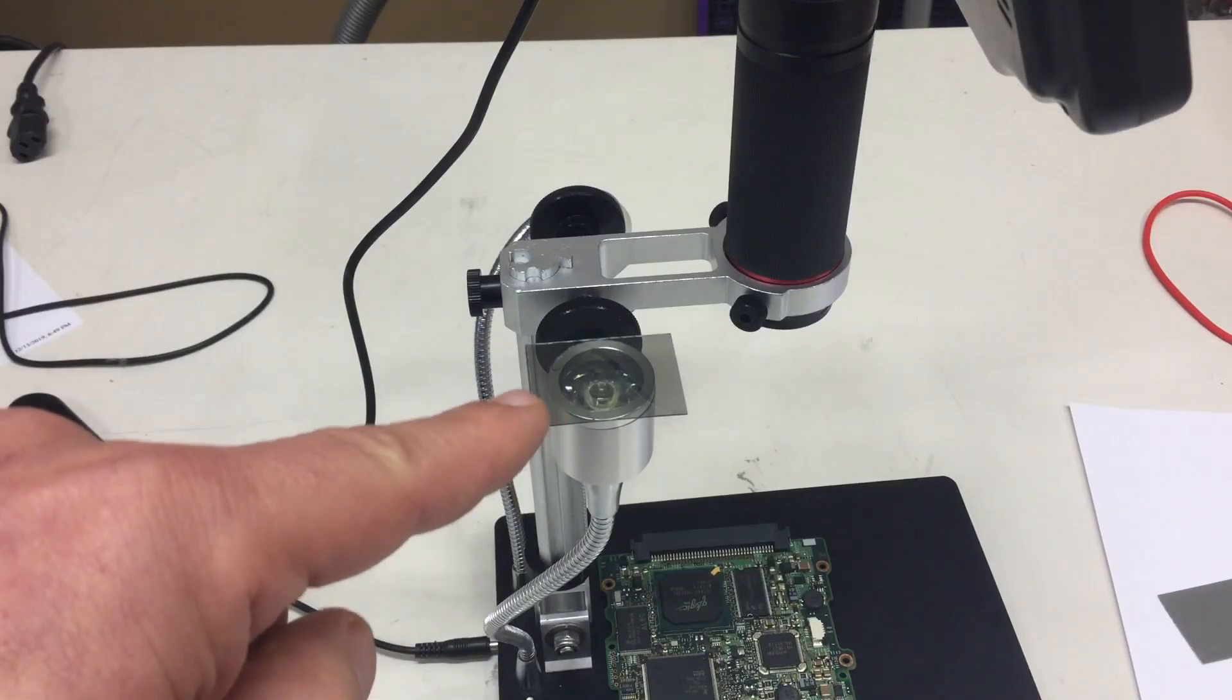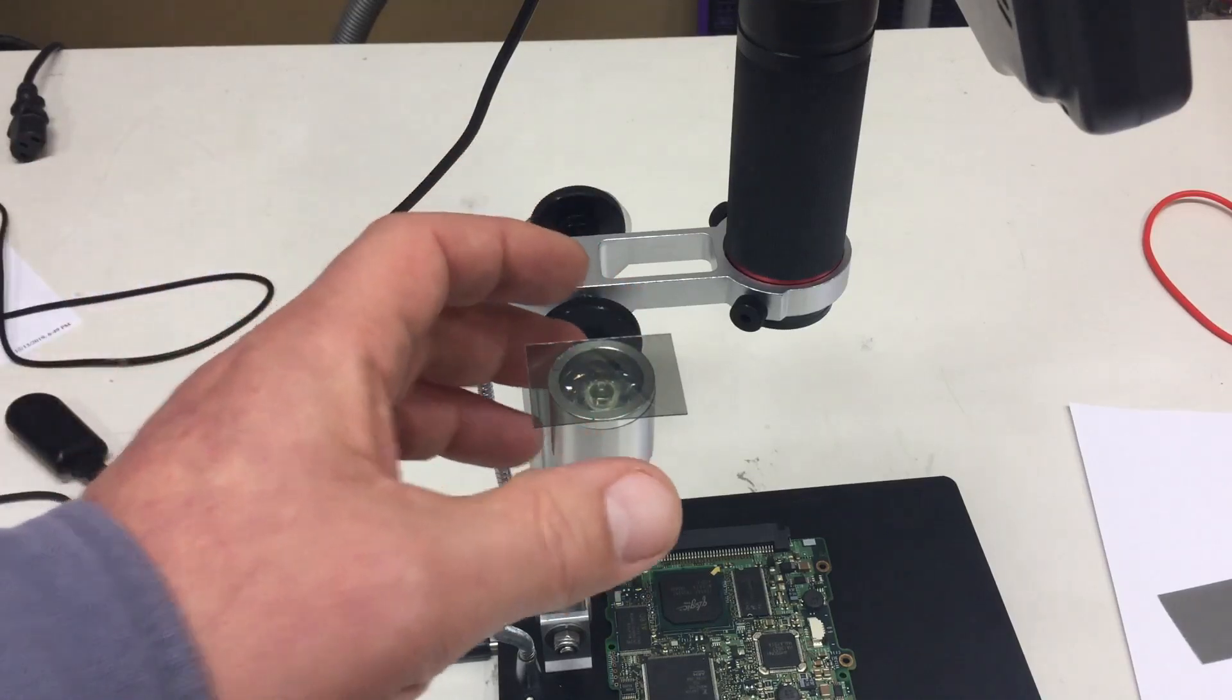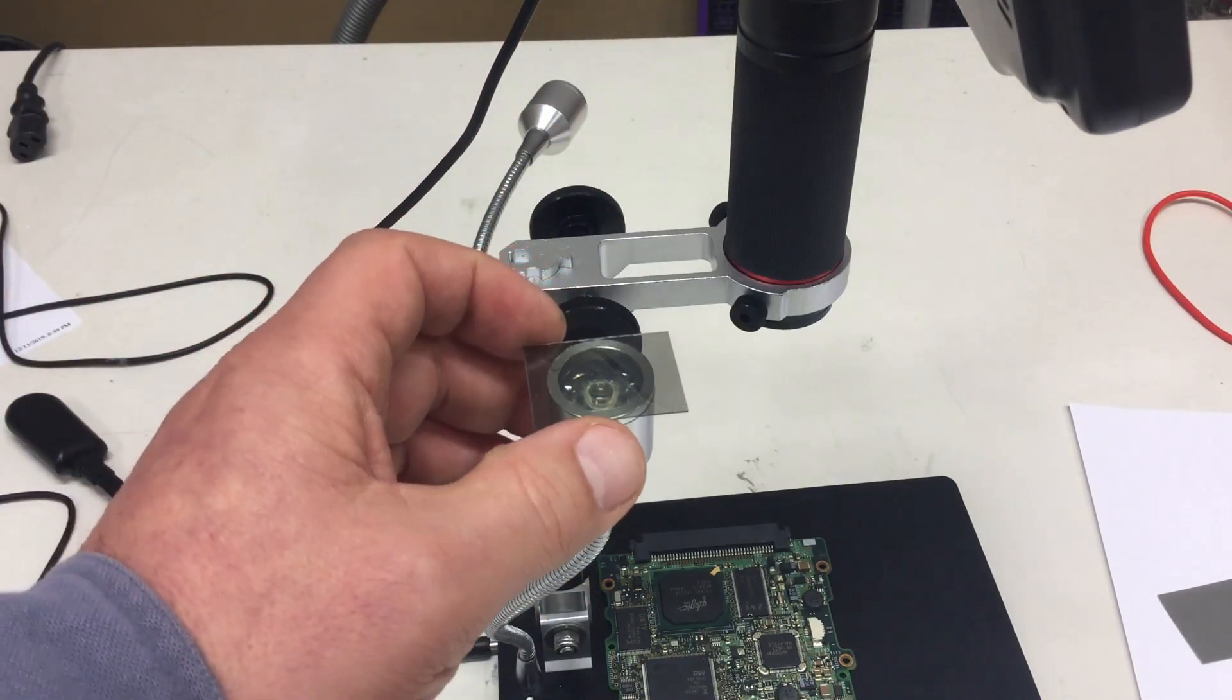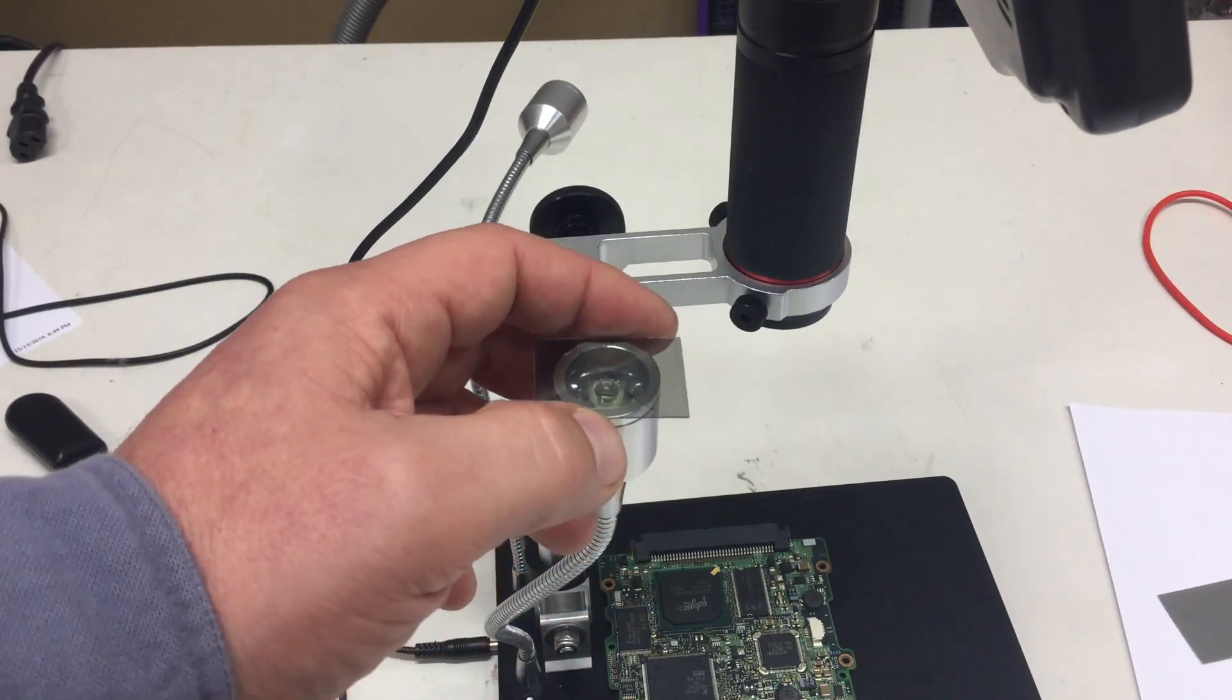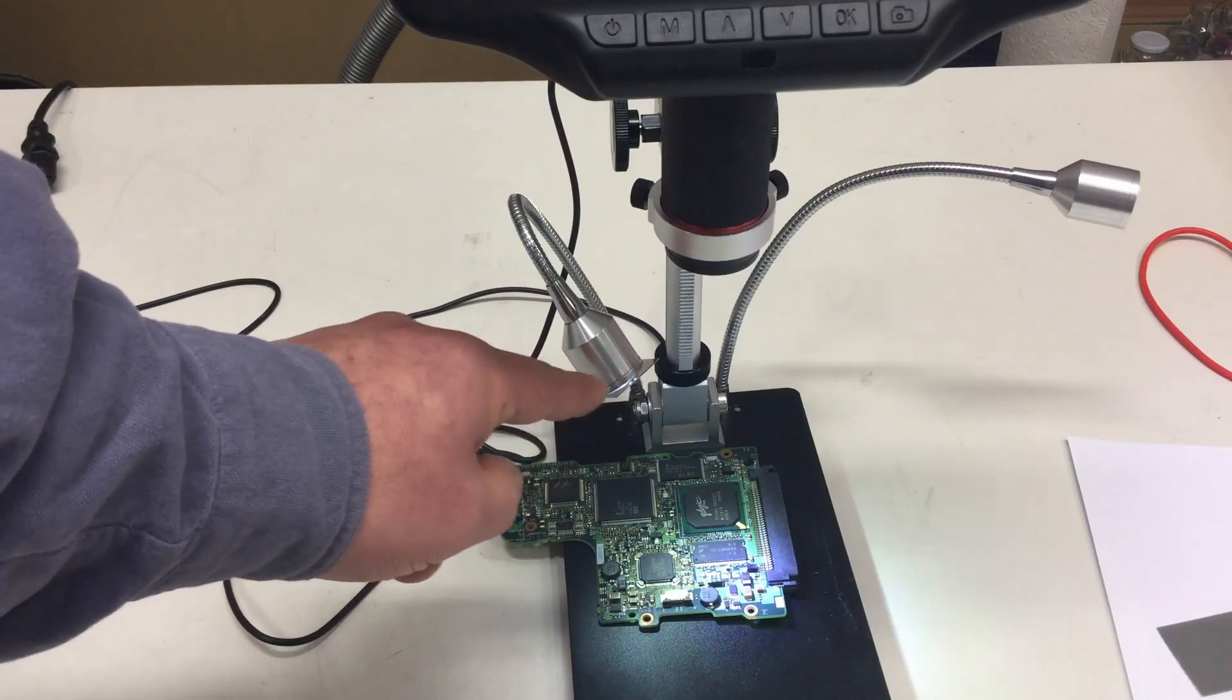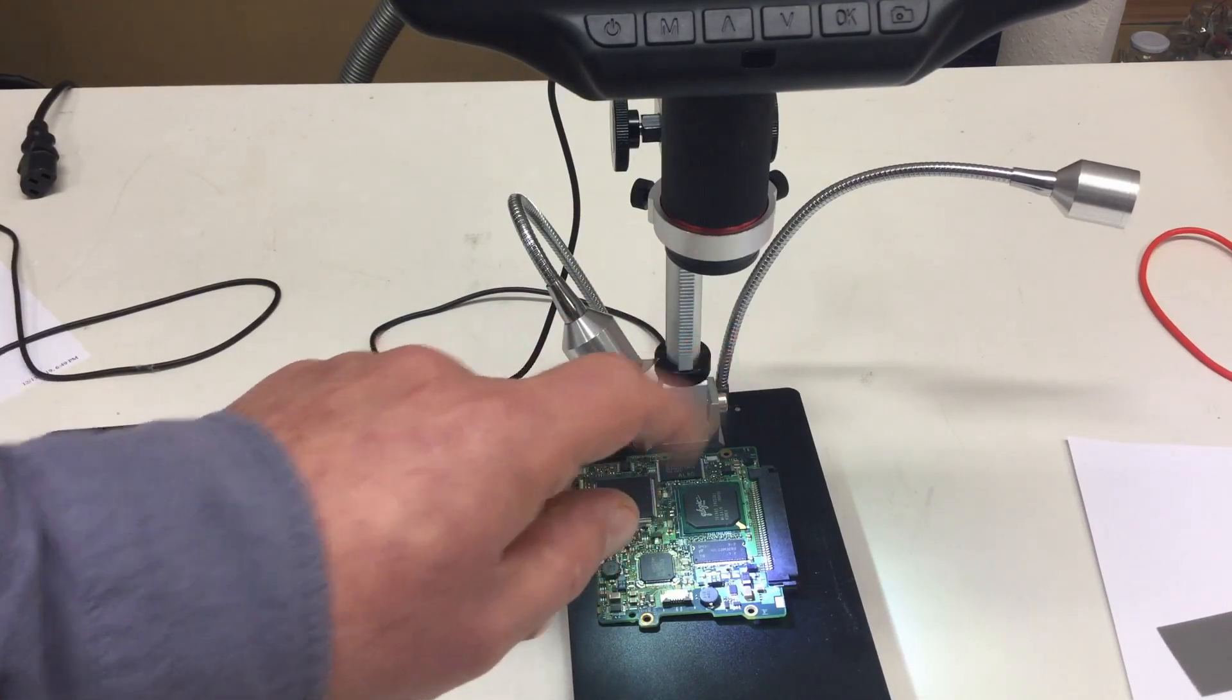So I glued on some of that polarization film with Loctite to one of my LED lights. The other is unchanged, and I will not use it, and I can even turn it by 90 degrees. And we will see if there is any effect. I'm only using the light with the polarization film in front to illuminate my object.